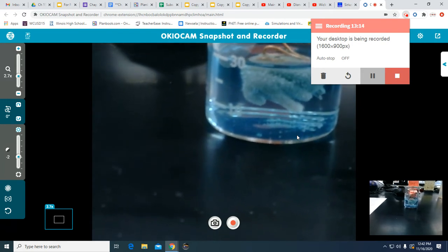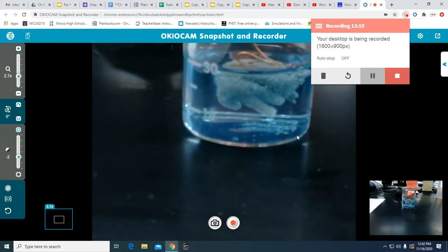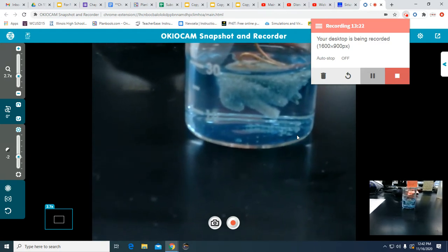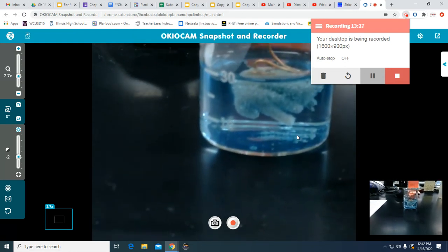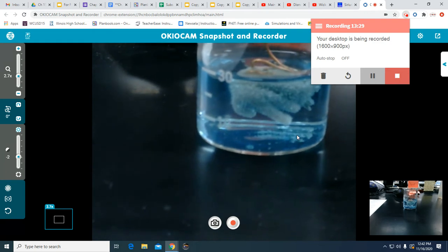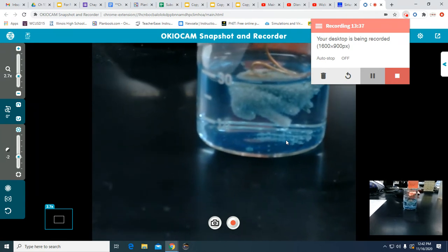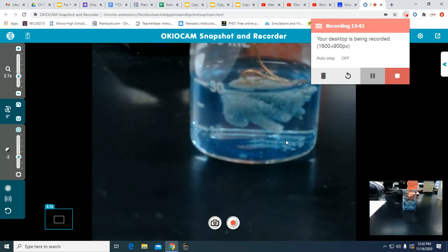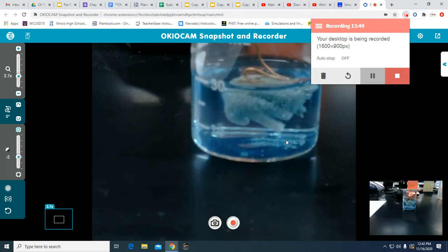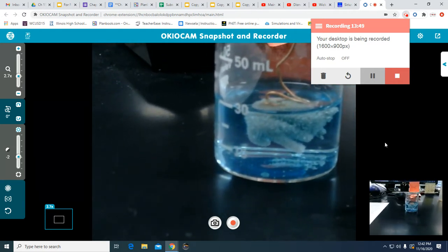And so that's when you start to ask yourself, what is the best process to extract silver in a situation like this? Is this the best way, or could we come up with other ways, or could we use the same way, just come up with a better way to catch the product that is lost, quote unquote, to where we can have minimal, if any, loss? So those are things we have to think about when we do experimentations. Is it the right one? And if it is the best way, can we make it better, quicker, so on and so forth?